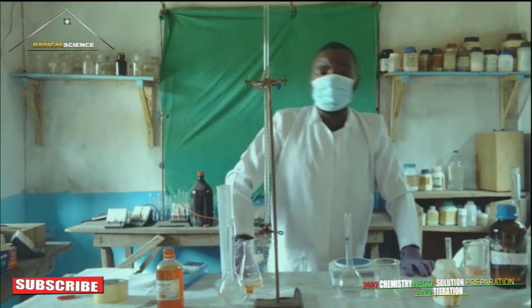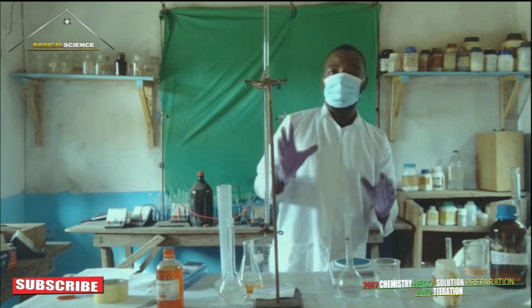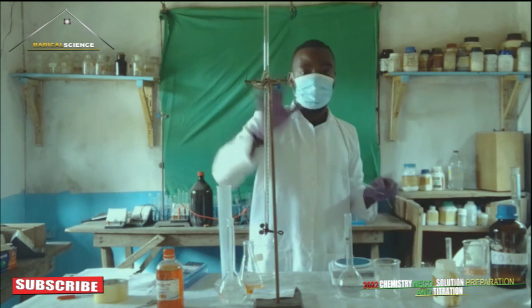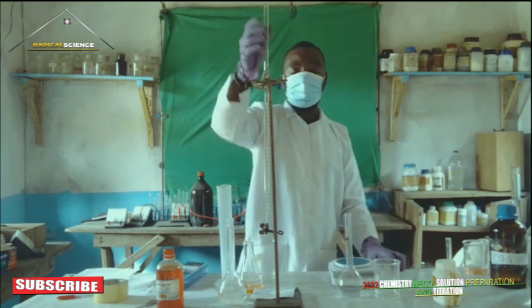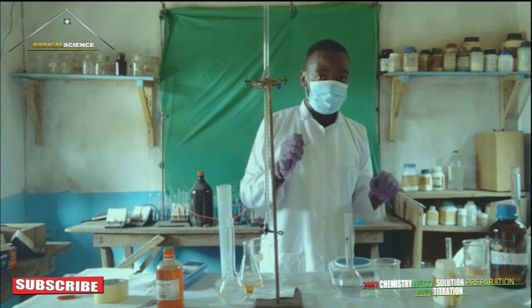The next step is the titration, so move over to the titration. Here we have our burette, which is already washed and rinsed with the chemical. Now we have our pipette. On this practical, we are going to be filling our burette with the acid while we pipette the base.